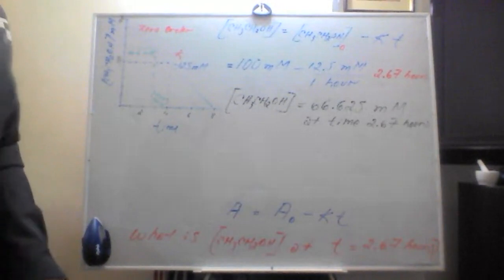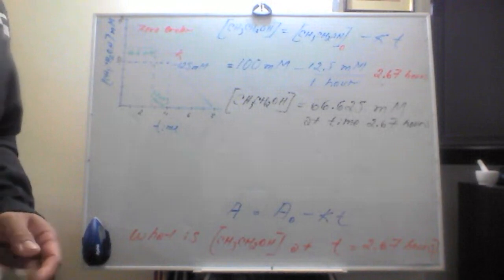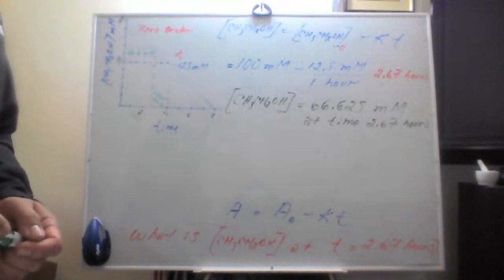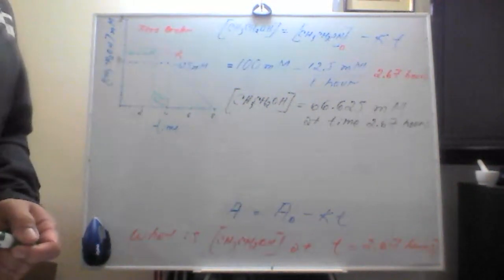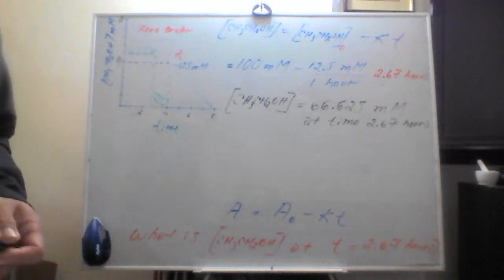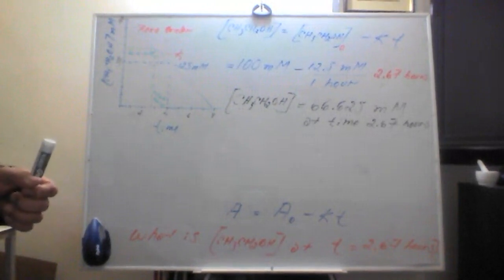We got peroxide, fresh potato, catalyzed the reaction. We start to see a lot of bubbles. Cooked potato did not catalyze the reaction. Apple catalyzed the reaction at a slightly slower rate. And when we try to change the concentration of the peroxide, the reaction did not change that much. Right, so let's go over those results.